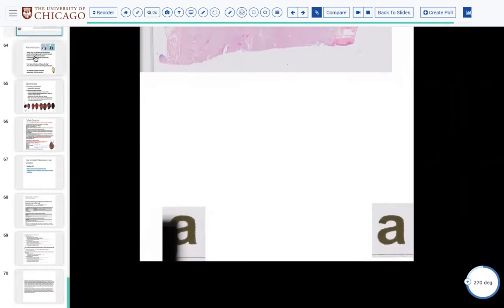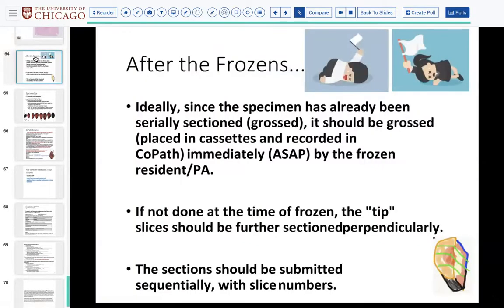If you find that helpful, you can be the driver of your own destiny at the time of frozen. If you find something is more helpful for you, that's fine, make it happen, because everybody is different. I used to be the kind of person who found the colors really hard to cut. I hated cutting the colors. So I would embed everything in clear and then just put a splotch of color at the edge of the block, just to make sure I knew that I had the right thing. But honestly, everybody's different and you've got to do what's good for you.